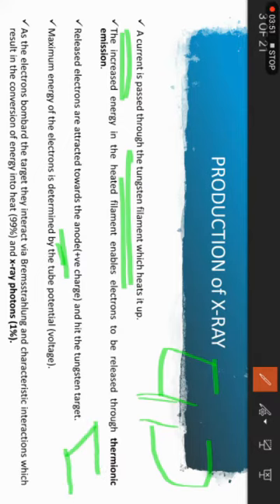focal part. You may be wondering why this tungsten part is slightly bent in nature. Why can't we keep it this way so that the electron beam hits like this? The answer is that we have to keep it a little bent.